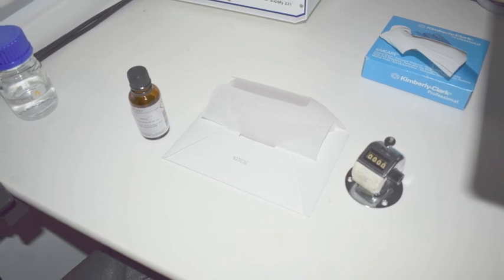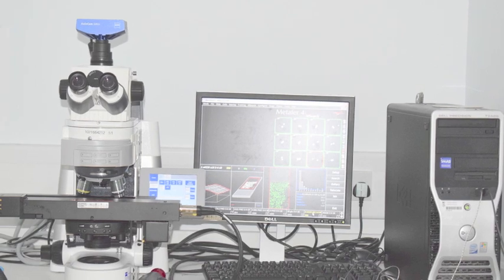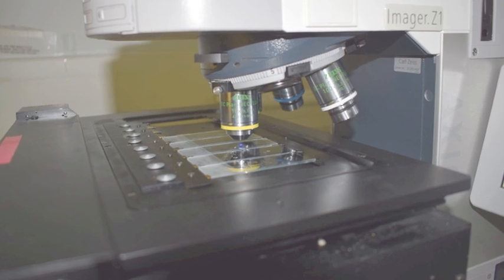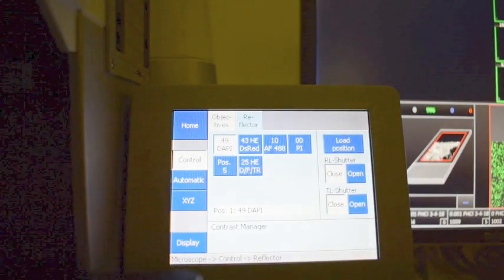Slides are scored using the semi-automated Metafer microscope system. They are scanned using the 10 times objective under the DAPI filter.